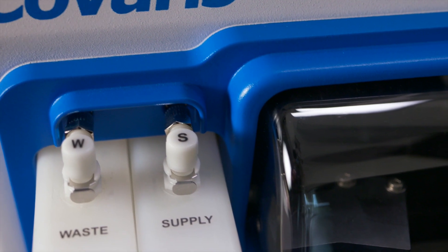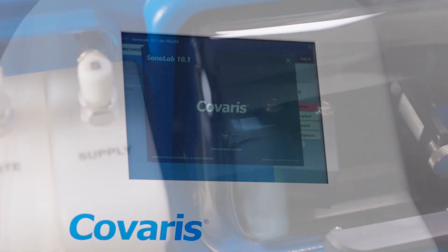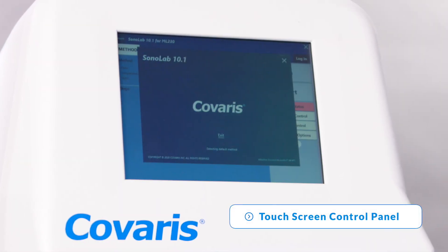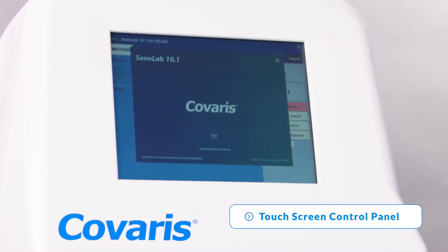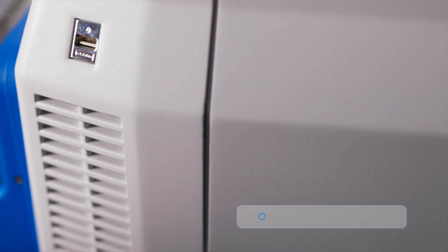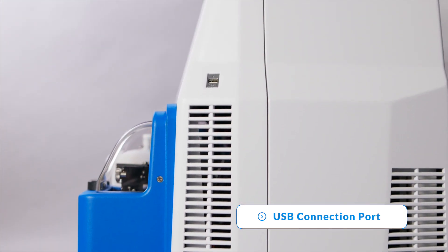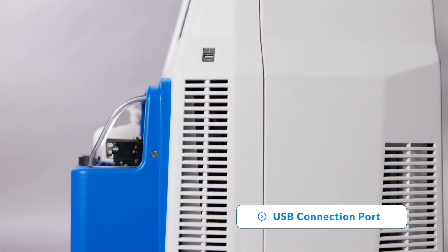This powerful and easy-to-use system has many unique features and benefits, including an easy-to-clean built-in touchscreen control panel, a USB connection port that allows users to import and export methods, rack definitions, history files, and more.